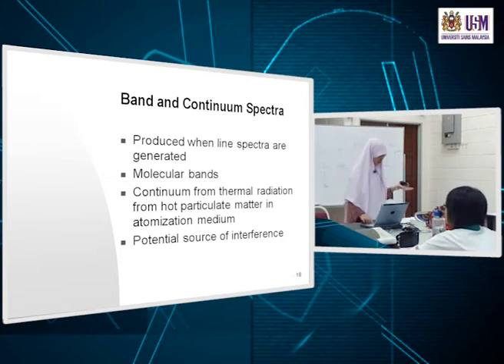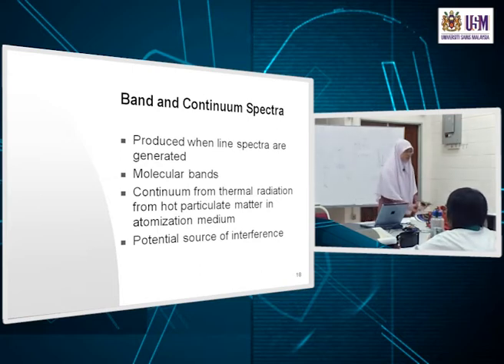Just this last thing, this is just an intro before we get into atomic absorption actually. We talk about atomization. How do you change things to atoms? You have your sample in solution. But in order for it to absorb the light from your source, remember your instrument, you have your source, your wavelength selector, your detector. But your sample is in solution.